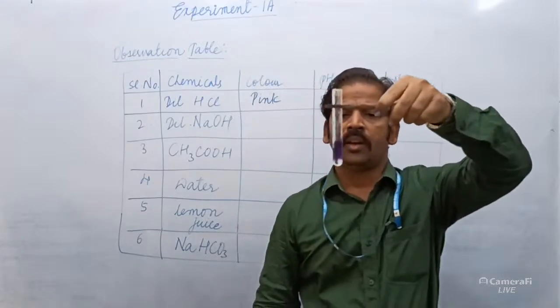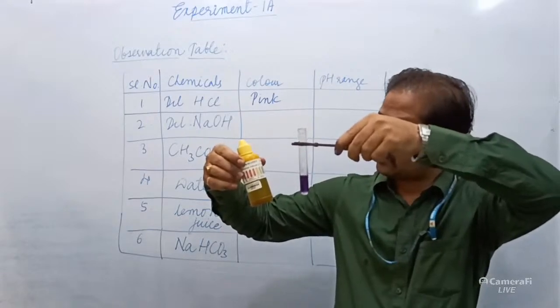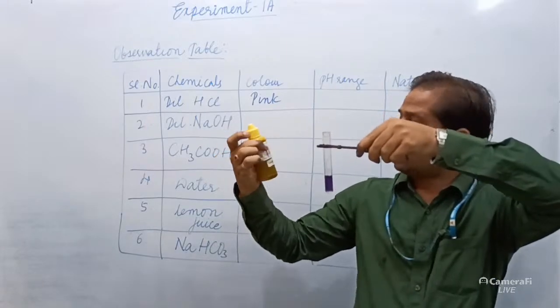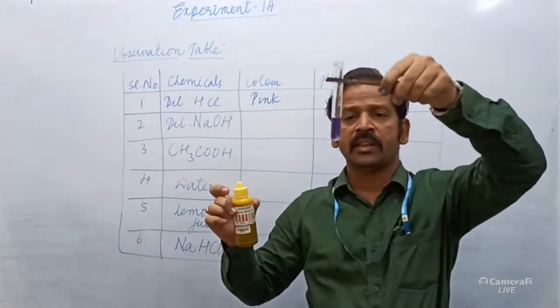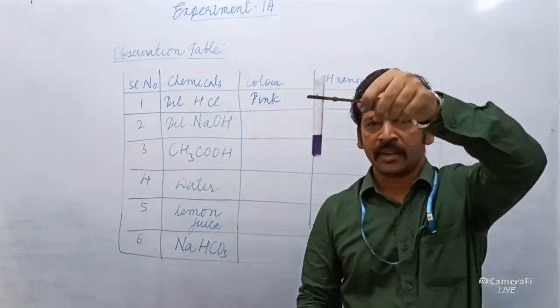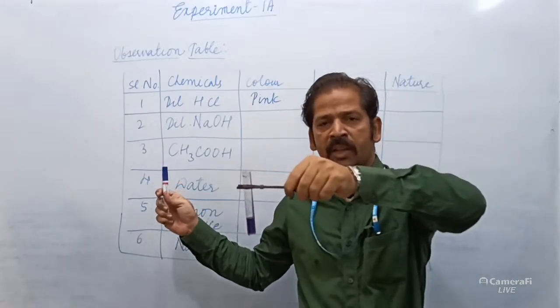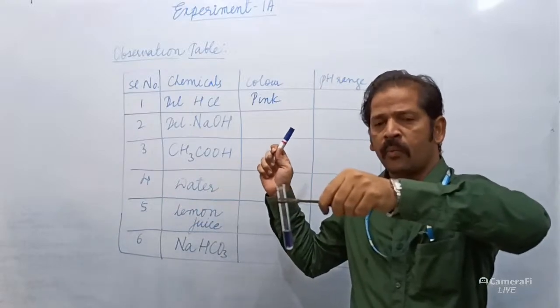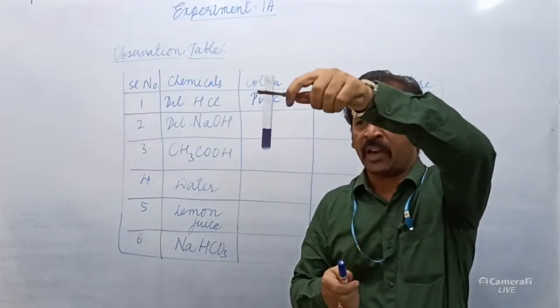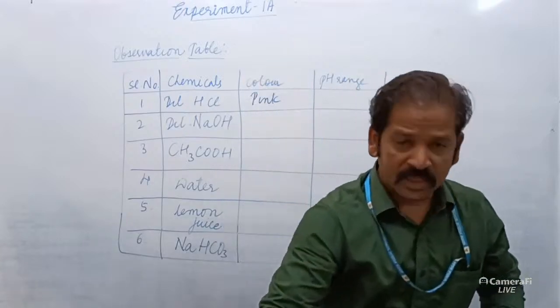Yes, it is a bit like indigo color. Here it is matching almost with dark blue, a range of red to blue. It is a bit light blue. You are able to see the color. It comes almost looking like violet only. A light color, not so dark. That was the second chemical.